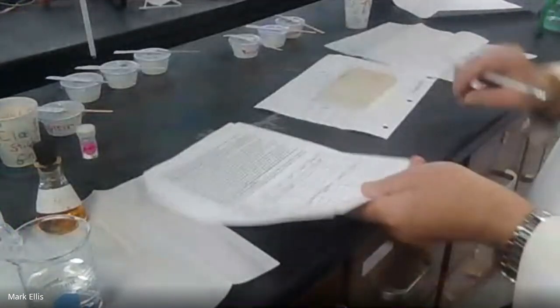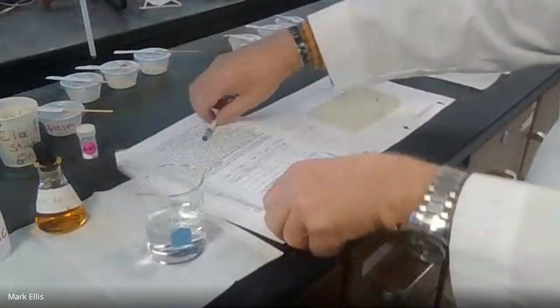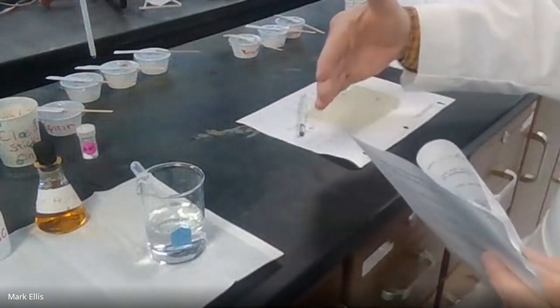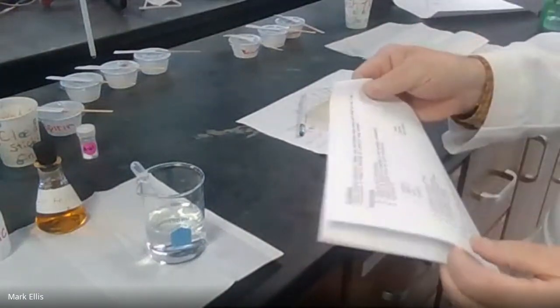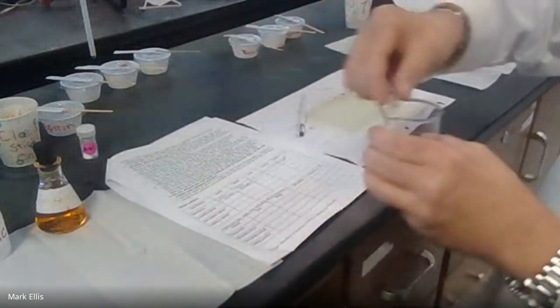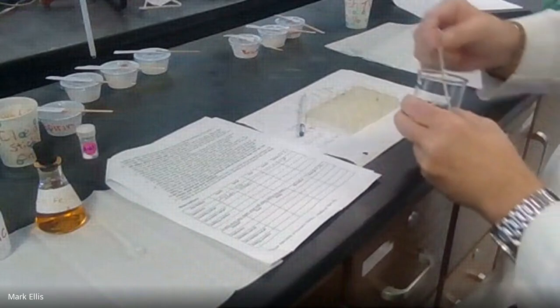Okay. Next is solubility. This is where I'm going to add, as you see in the directions, just a few drops. It says like 5 drops of water in each one of the second row. So not second column, second row. I'm going to add 5 drops. Now you don't have to count exactly 5 drops. 5 or 6 is good enough. So I'm going to squeeze a little bit.